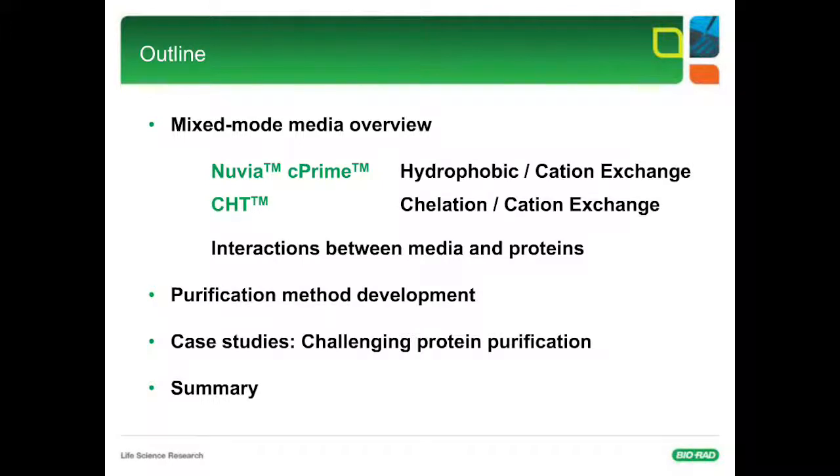With the knowledge of all these interactions, I will show you how we can develop an effective purification method and how we can tackle the purification challenges we have, because we know protein purification is not always straightforward. There is always a problem unique to a particular molecule or a particular purification process.